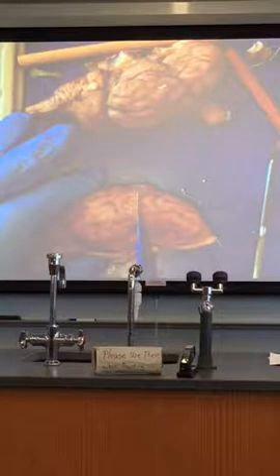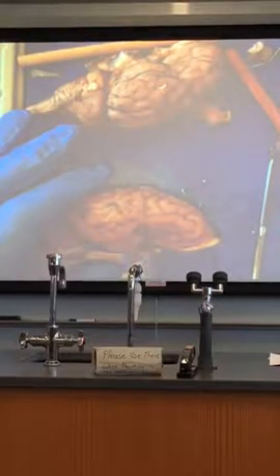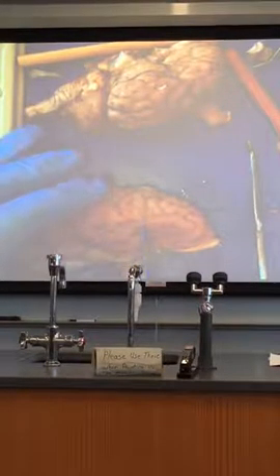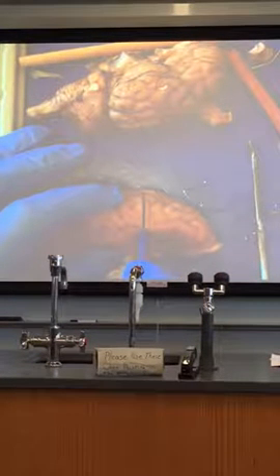What we'll do is we're going to make a cut about right here. Doesn't matter which side you choose. We're going to be able to see gray matter and white matter of the cerebrum. So just make a cut, nice and clean.